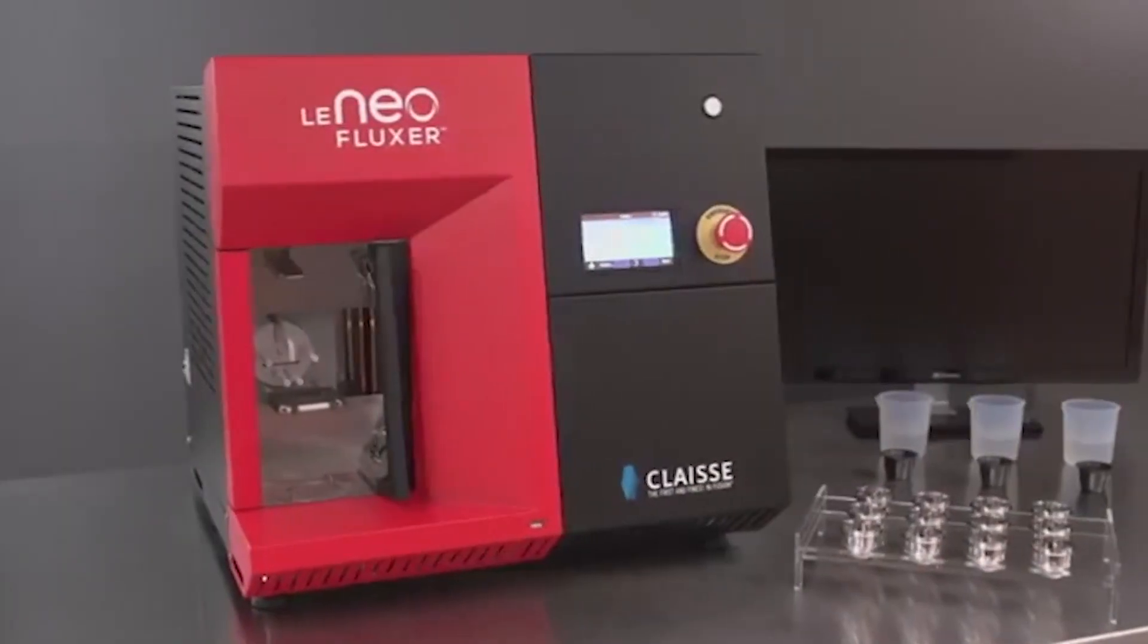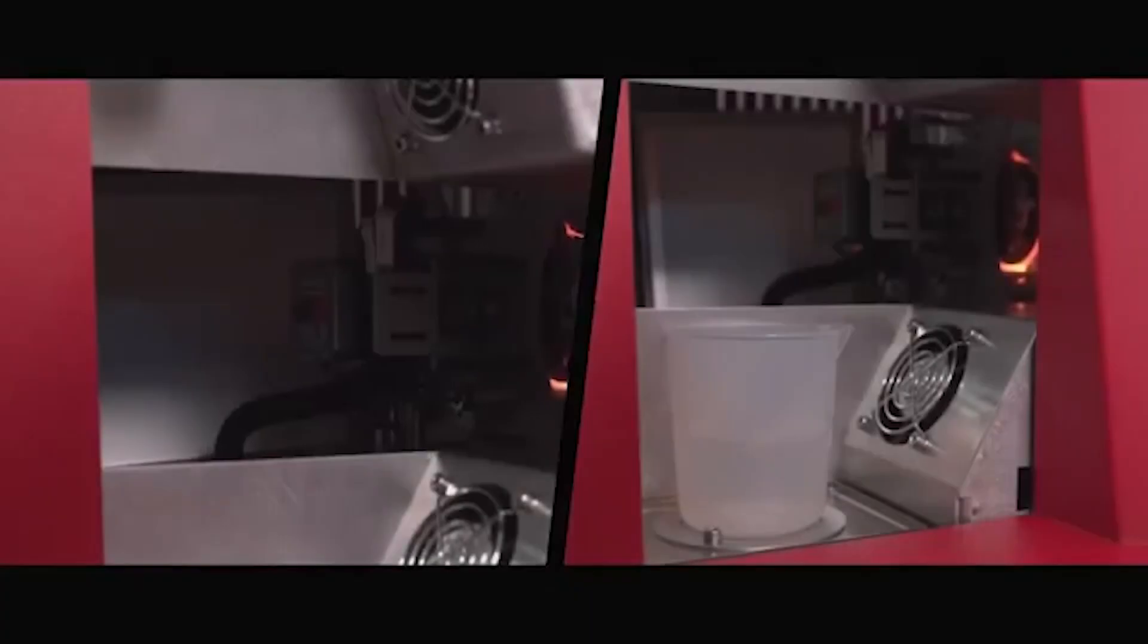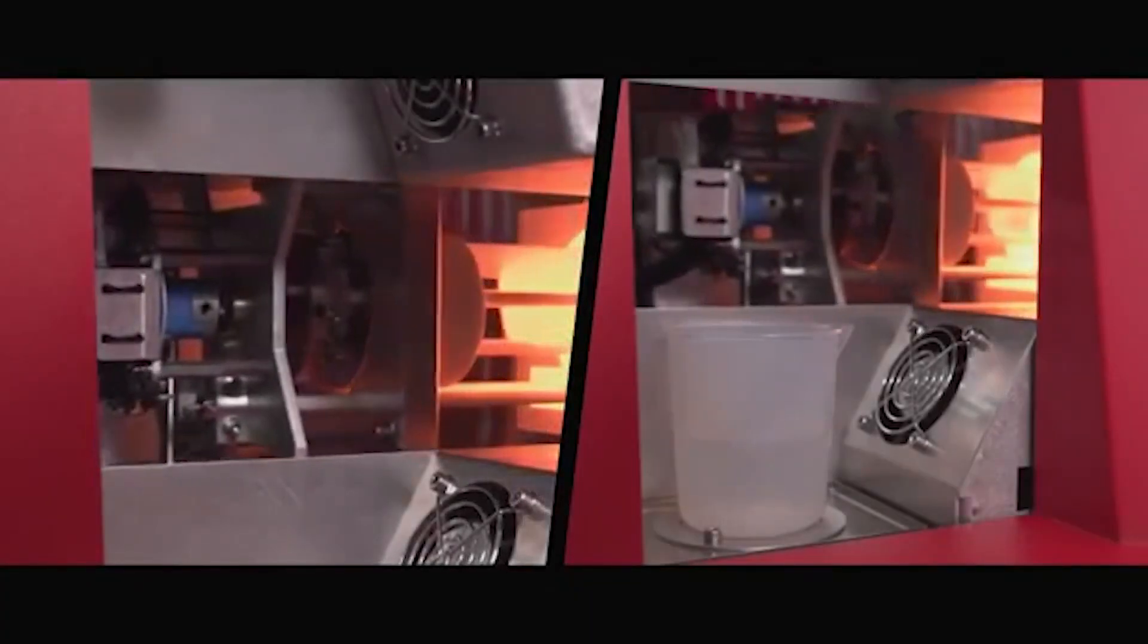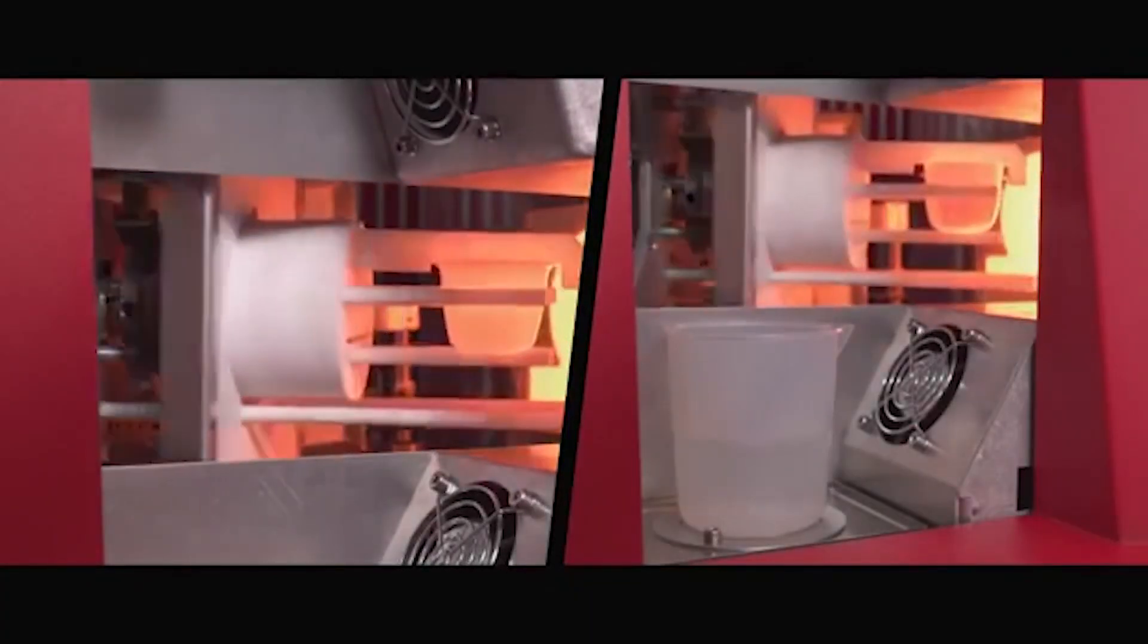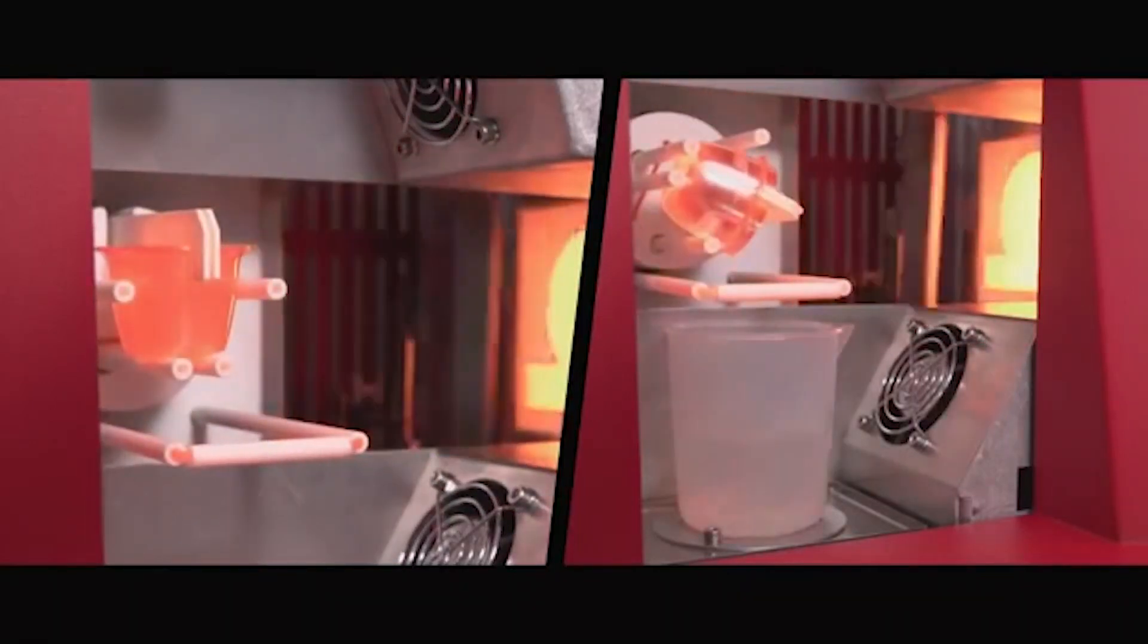With over 40 years of experience, we help customers from all around the world to prepare their samples for XRF, ICP and AA analysis.